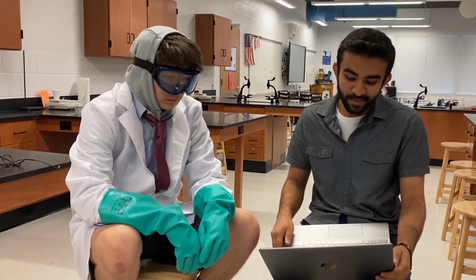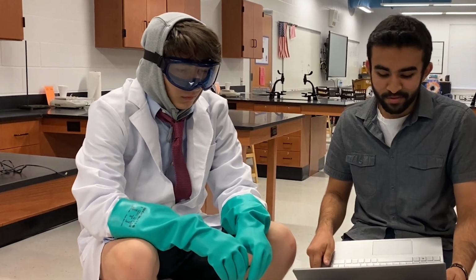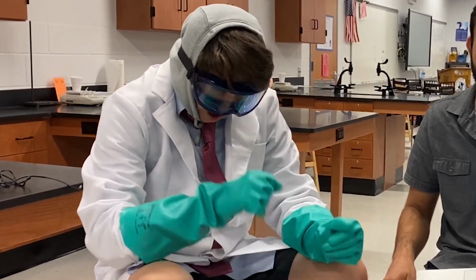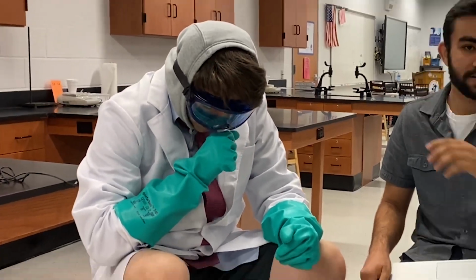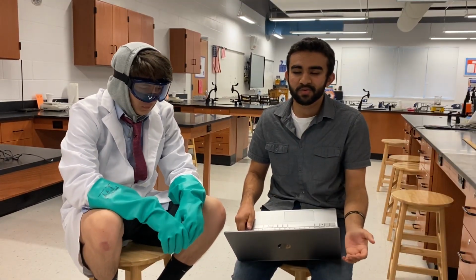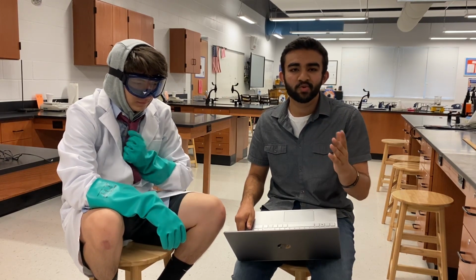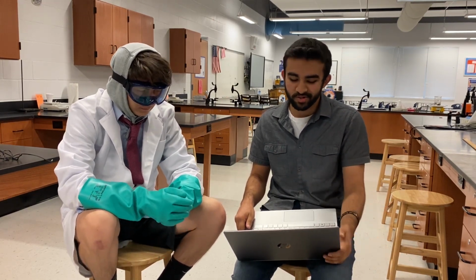For example, number 1, conduct yourself in a responsible manner at all times in the science classroom and laboratory. So it'd be important to have a sense of respect in the classroom because you don't want to accidentally harm anyone else, and you would want to respect the person who is supposed to supervise you and lead you on this journey.